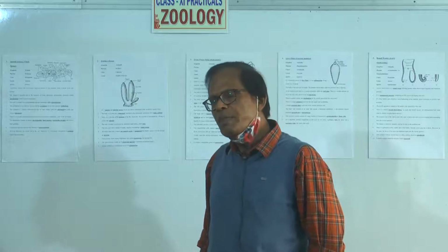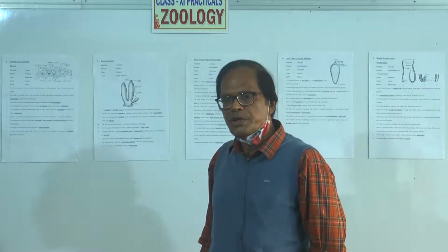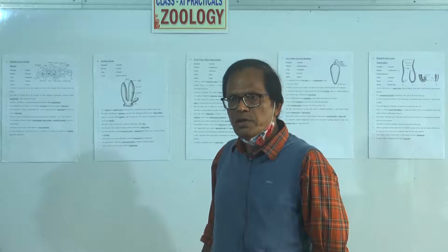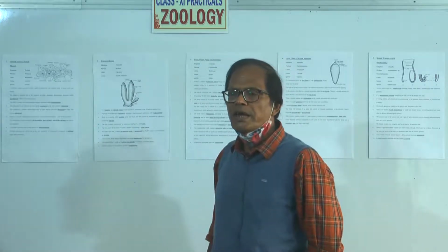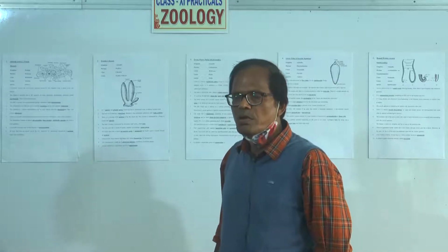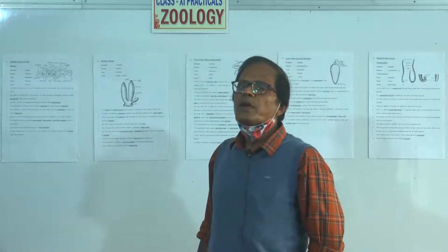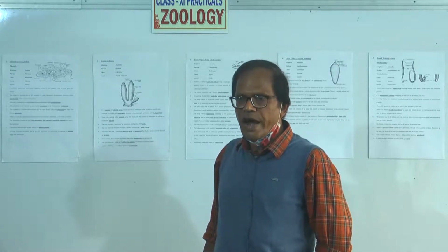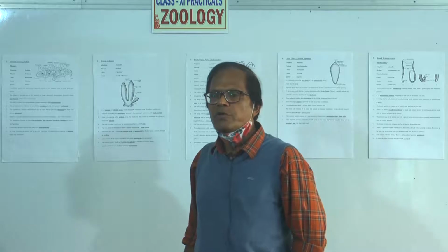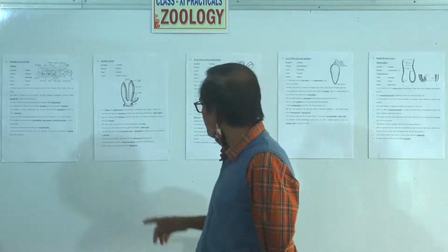The osculum is surrounded by a fringe called the oscular fringe. The oscular fringe is made up of many calcareous spicules. These calcareous spicules protect the body from any outside animal entering through the osculum.